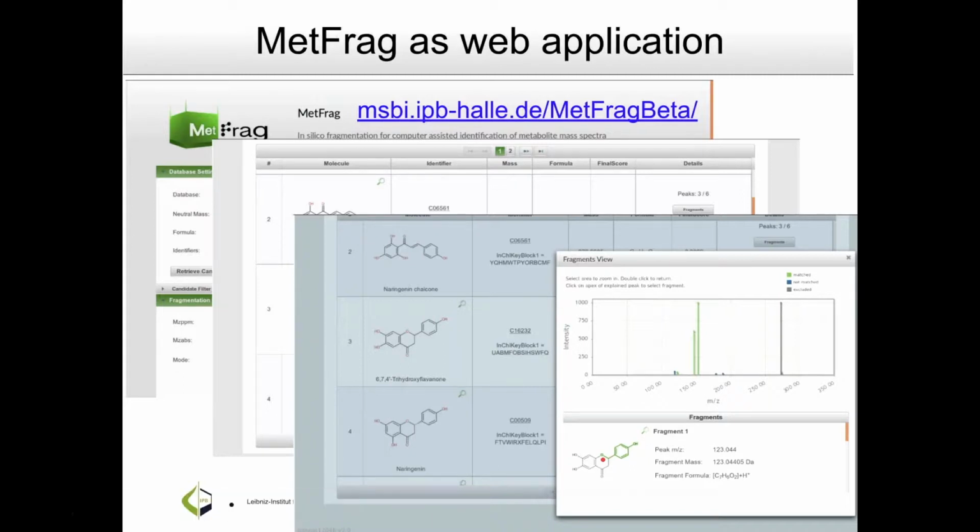Now, the caveat here is that we are only highlighting substructures of the parent molecule and the corresponding mass in the spectrum. We are not claiming that this would be a physical simulation of what's happening in gas phase chemistry inside the tandem mass spectrometry. For that, our approach is not sophisticated enough, but on the other hand, it's much quicker than any energy calculations that you could do in the same time.